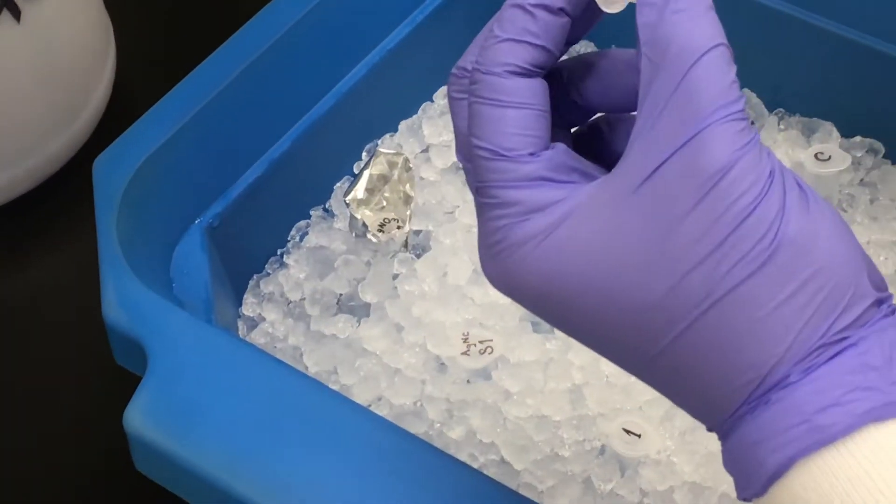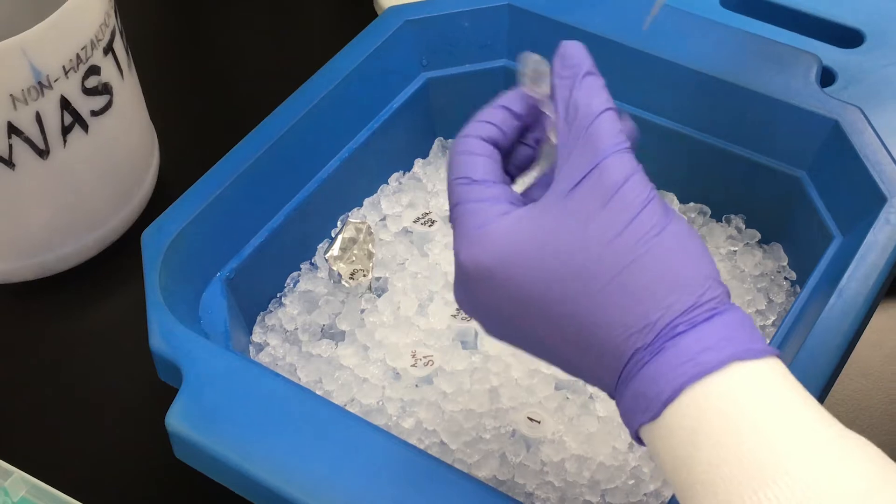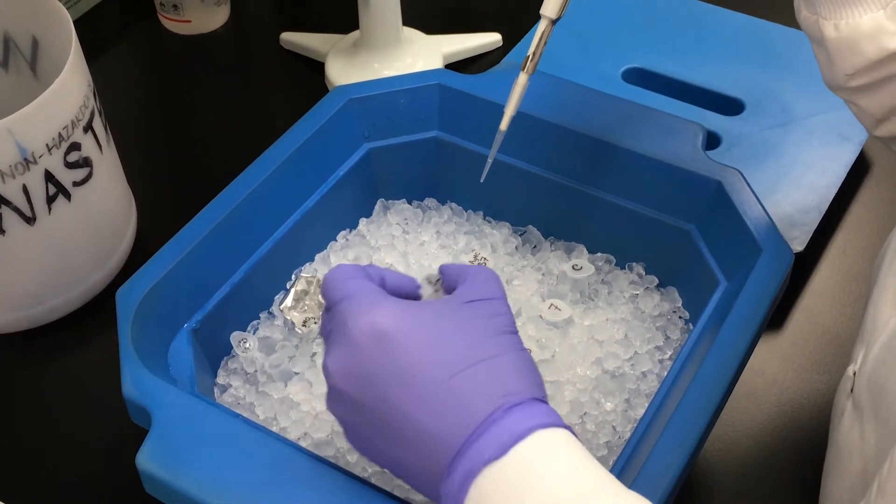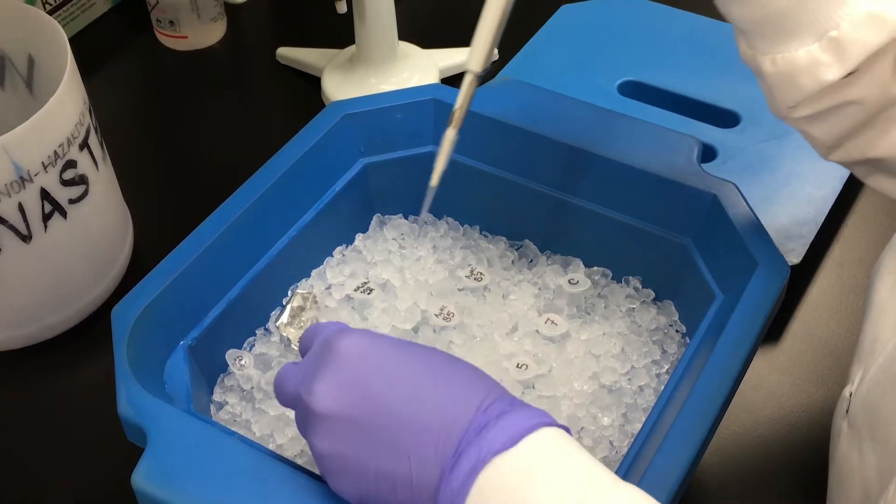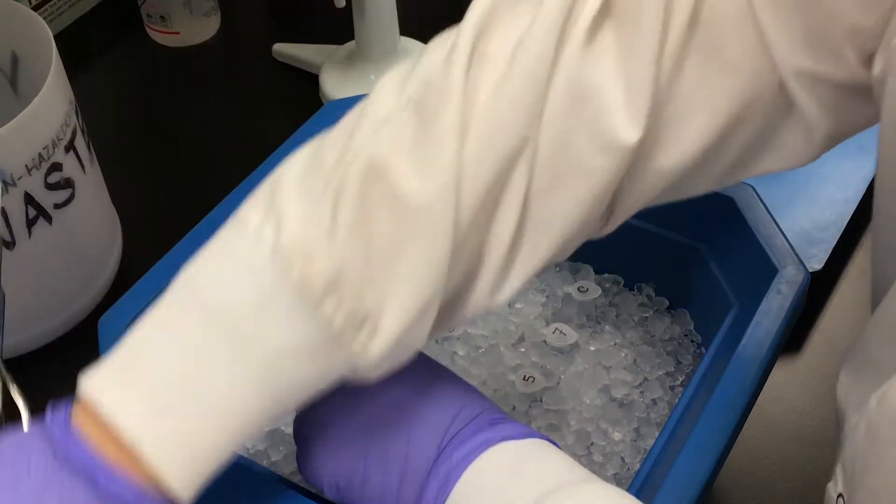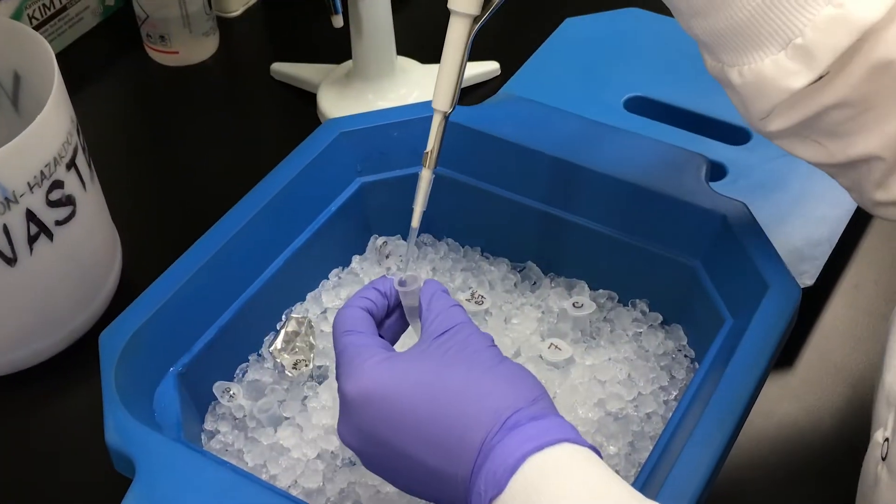The first step is to dilute the DNA template solutions with double deionized water, labeled here as DDIH2O. The volumes needed are calculated ahead of time based off the absorbance of the original DNA template stock to achieve a final concentration of 30 micromolar.